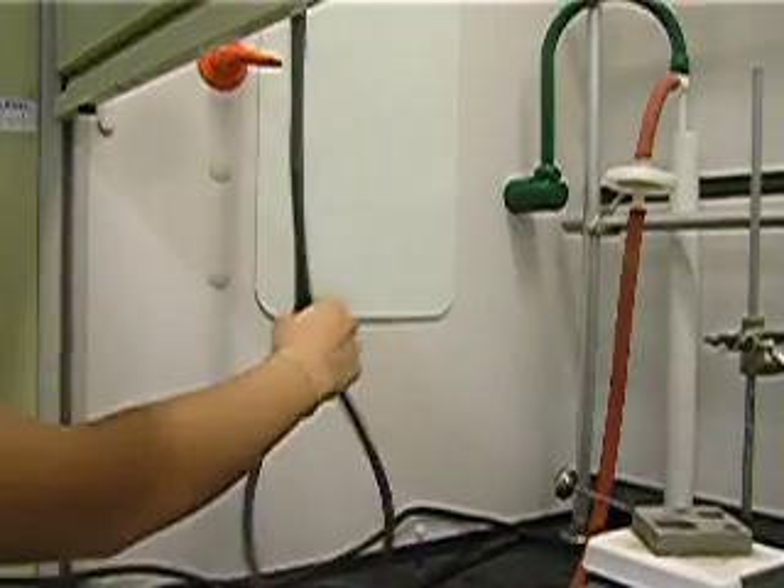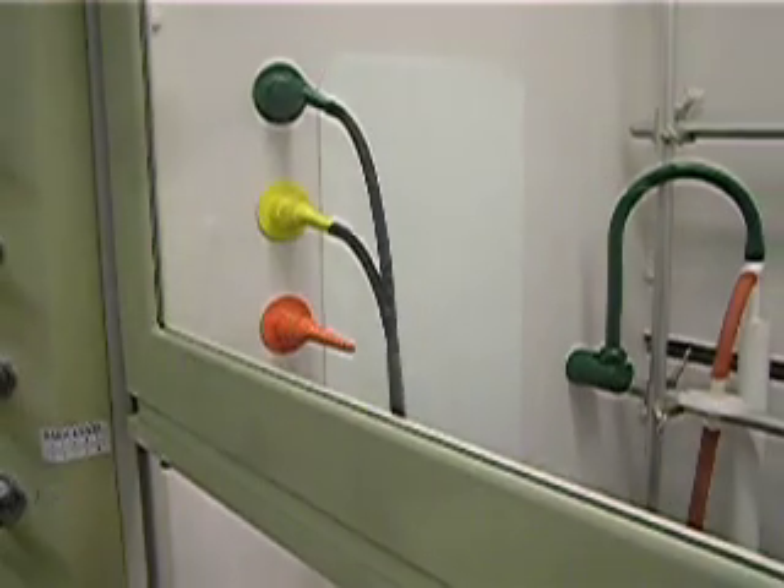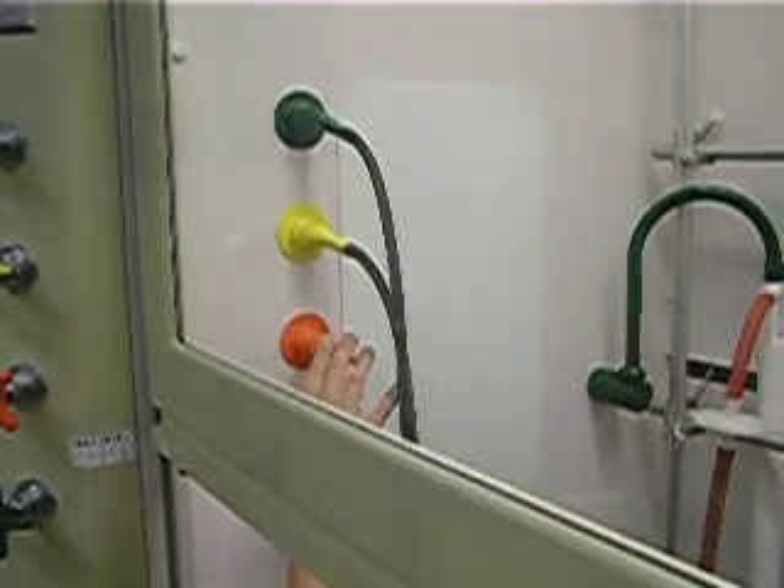Over here you will have two black tubes, and you want to make sure at the end to always have them connected to two of the three stems over here.